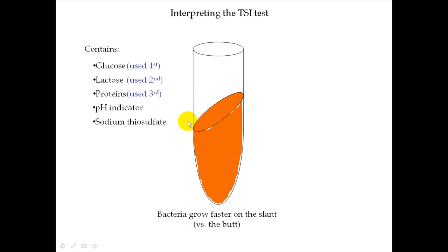the way you can tell if it's being metabolized is, it turns out that one of the products of sodium thiosulfate metabolism is hydrogen sulfide. And so if there's hydrogen sulfide being released as a result of sodium thiosulfate metabolism, you'd be able to visualize that because there's something else added to the tube that basically acts as a hydrogen sulfide detector.